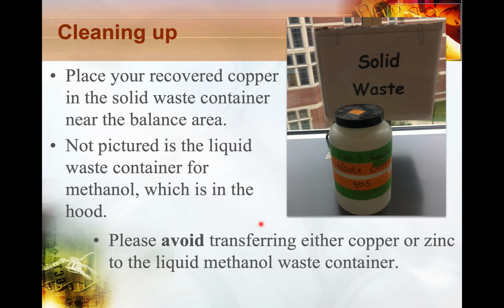And then finally, once you're done, you'll clean up and put your copper that you produce into the solid waste. You're going to put the methanol away appropriately as well, and we're going to try to ensure that you don't put the copper and methanol or the zinc and methanol in the same container. We want to keep those separate. So be cautious again. We want to keep the liquid methanol in one container, the copper in another, and the zinc in another.